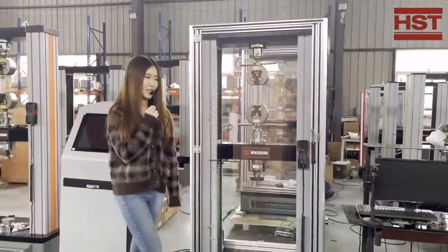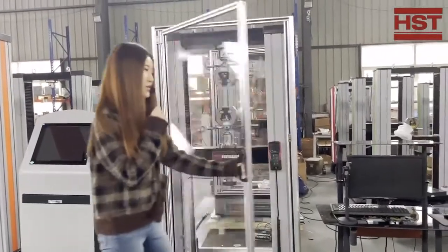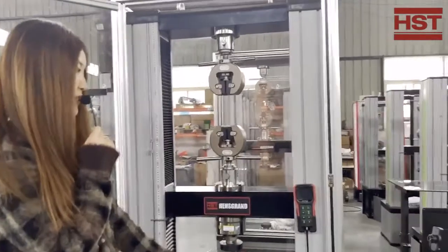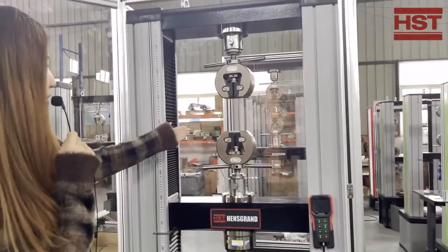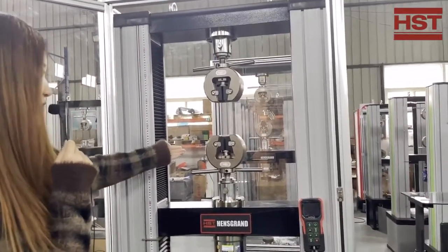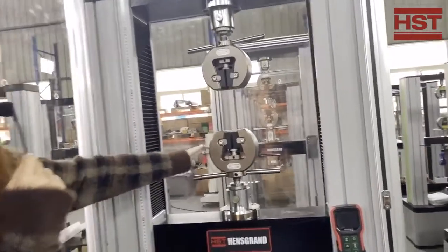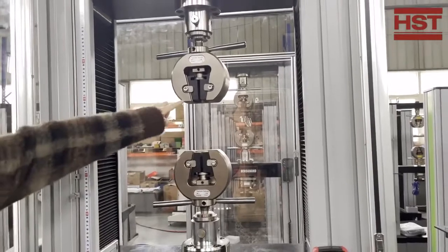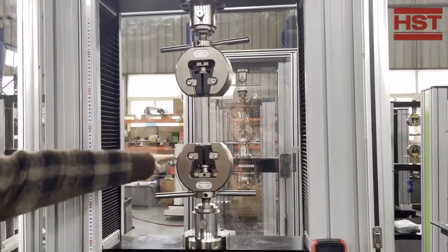I'm going to introduce our universal testing machine electronics model from each section. The top part is for tension testing — it comes with wedge grips. Regularly it will come with either flat or round jaws for the tension test.